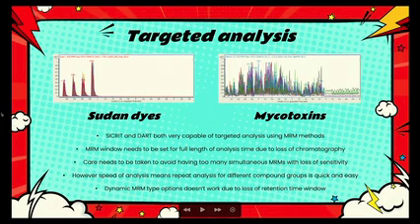You have to be careful not to have too many MRMs running, because you're not now doing a small number of MRMs and then going to another set of MRMs and then another set. You have to be careful not to have too many running, or you'll lose sensitivity. But the speed of analysis means that you can just have one block of MRMs and then repeat for another block instead of trying to separate out things. So even if we have to analyse the sample 3 times at 20 seconds per sample, we're still analysing the sample for 1 minute, so it still makes it a very, very quick analysis.